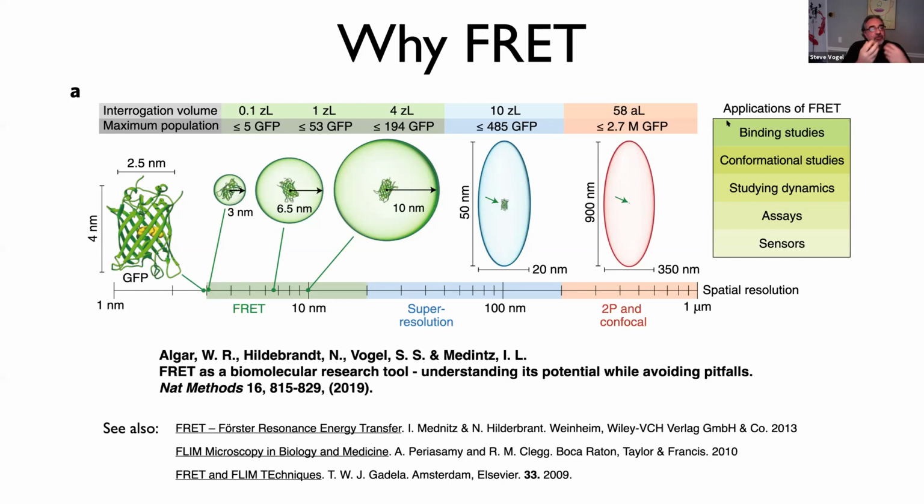That's not always true, right? So nonetheless, this technique can be used for binding studies. It can be used to study conformational changes in proteins, dynamic studies, assays, biosensors. There are many, many useful biological applications that use this FRET phenomenon. And what's unique about this FRET phenomenon is depicted in the main panel here.